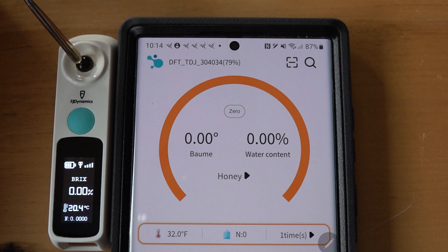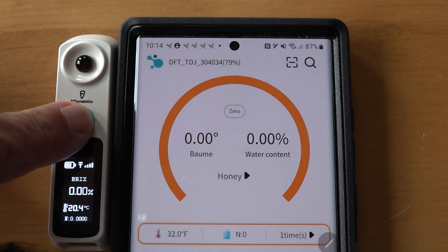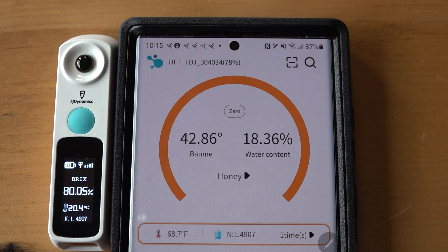Let's get more of that Castle Hives honey on there and see if we're still at that dangerously high water content according to FJ Dynamics. If I click the button on the sensor itself it activates independently but just shows Brix: 80.3%. To get the water percentage I click the green button in the app. It goes into measurement mode, green light comes on, and now we're at 18.36% water content — a big jump down from the previous 22.87%.